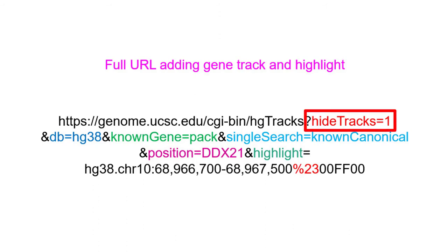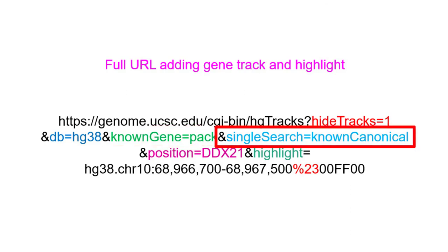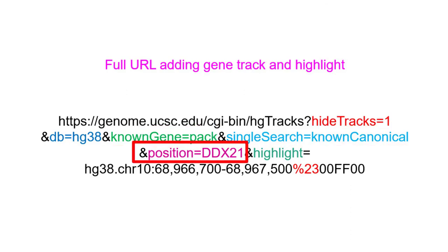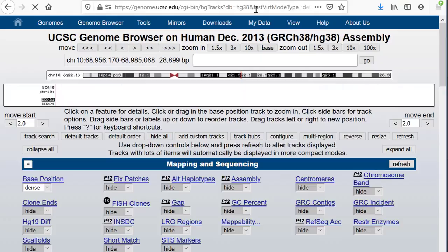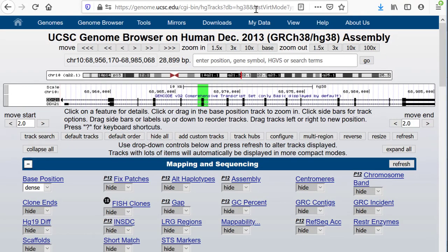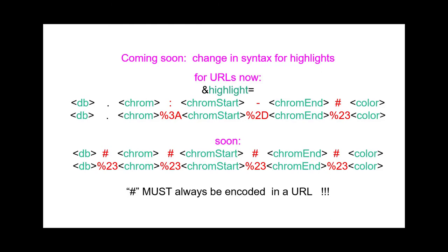Making the full URL will show the whole gene and highlight exon 6 in green. We have hide tracks, we have knownGene equals pack, we have singleSearch equals knownCanonical, and position equals gene DDX21, and then the highlight. This gives the full gene in the window with the exon highlighted green. While this video was in post-production, a change was made in the format for highlighting — when the change is released, all of the separators between data items will be hashtags, %23 in links.